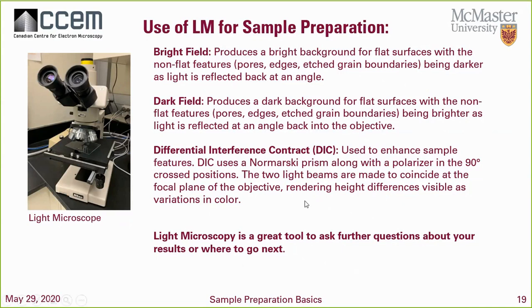So whatever you see will stand out in a different color. It might be a scratch, or you'll start to see that topography stand out a lot more on your sample, which might show you something or might give you an idea of what's going on the surface of that sample. Okay, so light microscopy is just a great tool to ask further questions about your results and where to go next.